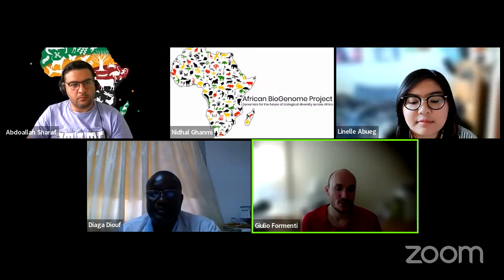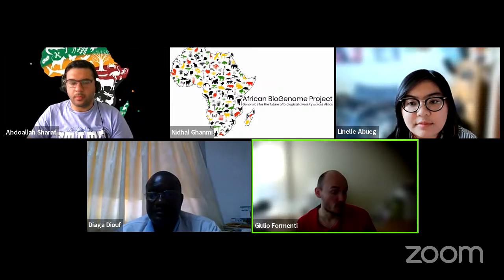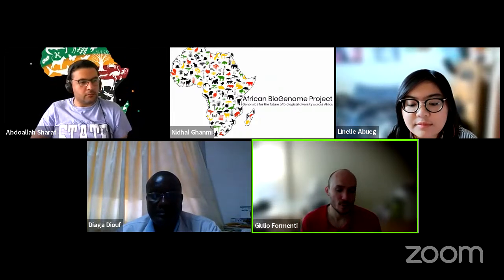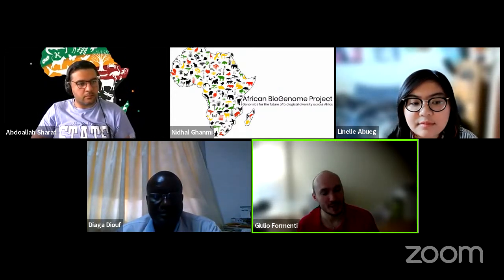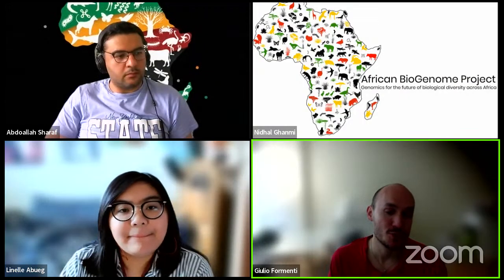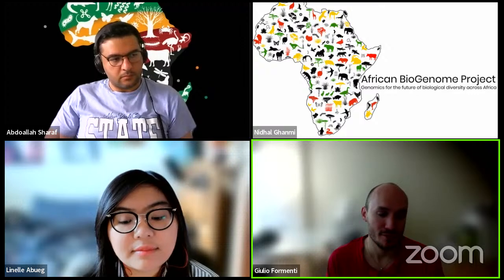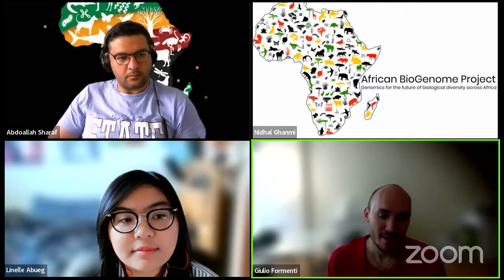I mean, if you have it installed locally, you will depend on the compute available in the Galaxy Pulsar system. But I would say it would be even more interesting if we could start to think about new ways to evaluate our assemblies. For instance, FastK, as opposed to other k-mer counters, has some interesting features that could allow that. But that's also an active area of, let's say, R&D.